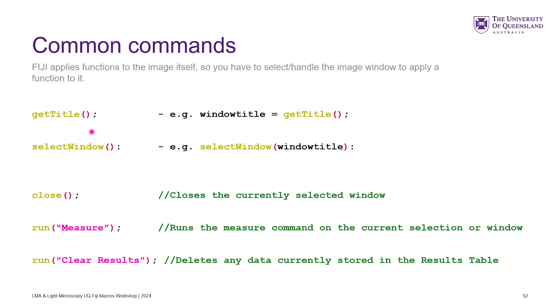Two useful commands: close — another one, keeps things tidy. And then run measure, which runs the measure command. Run clear results, clears the results. I showed you before how you clear the log window with the print command and the clear command. So those are just useful things you'll use in the coming exercise.